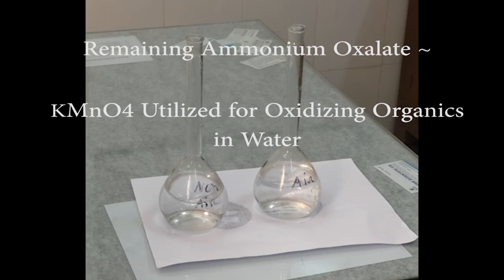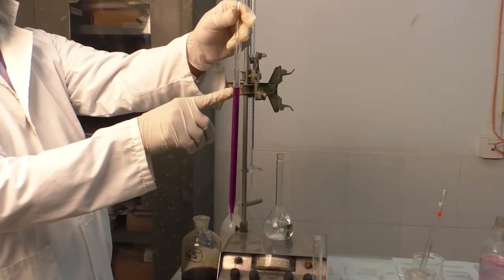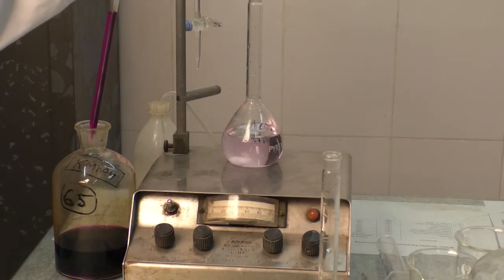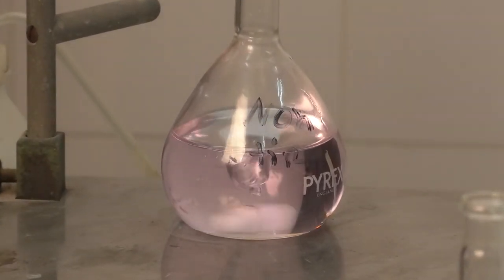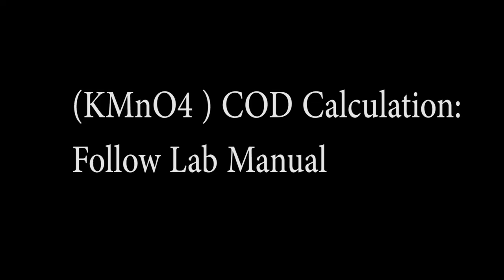To determine the remaining ammonium oxalate, the solutions will be titrated with potassium permanganate. Potassium permanganate will be added to the solutions until the first appearance of the pink color. The pink color indicates the end point of the titration. Then record the milliliters of potassium permanganate used, and you can calculate the COD as per the calculation method shown in the lab manual.